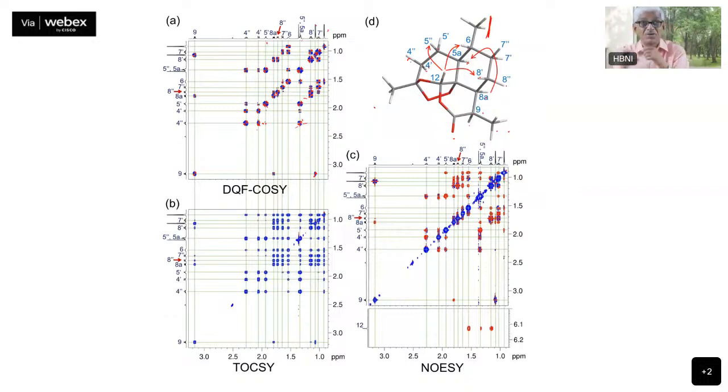You see, this is how we can do the analysis. I assign the individual resonances on the basis of the TOCSY spectrum, which is so useful here. In this case, in the double quantum filtered COSY, you show correlation only to the 6 there. But of course, you could not figure out whether the 6 is the methyl or not, because 6 can be connected to many other things. But this will actually show the whole relay. Of course, the chemical shift will tell you it is like a methyl. This whole thing is relay. So that is the TOCSY variant.